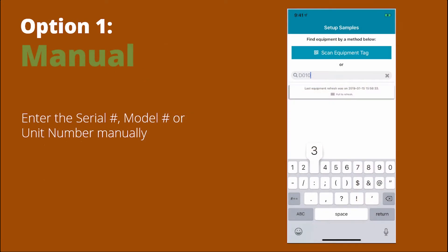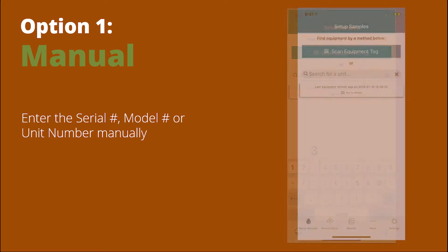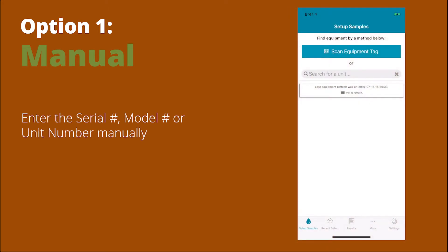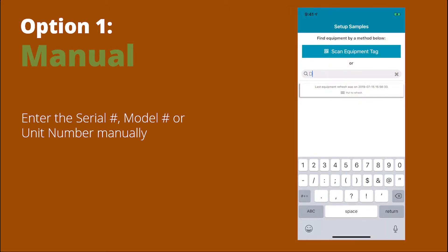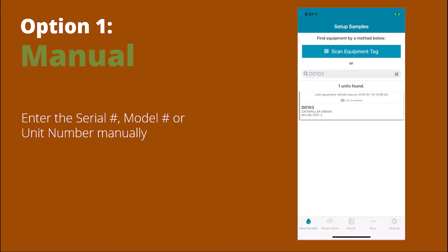Let's do the first one — manual entry of the serial number, model number, or unit number. Start the search by going to Set Up Samples and typing in the information you know about the equipment. Once you've found it, select it and move on to the next step.